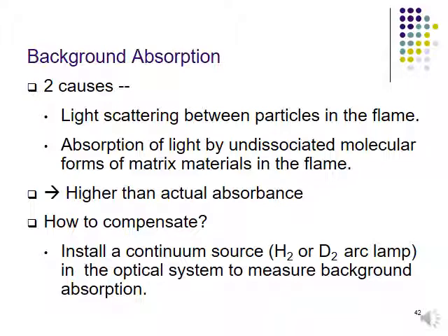When light scattering occurs, it gives a higher absorbance signal, and undissociated molecular forms of matrix materials also contribute to a higher absorbance signal.